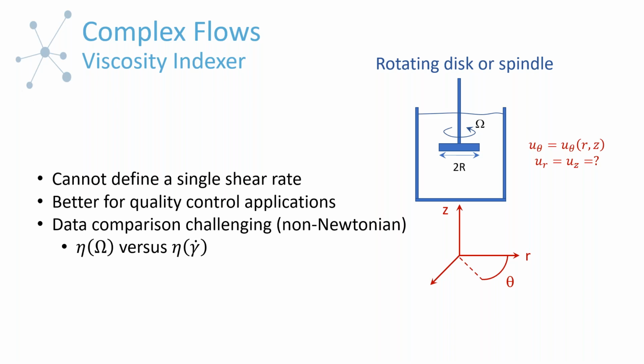So that's really all I'm going to say at the moment about the complex flows. I just wanted to put it out there because it is a measurement, and since we're talking about the flow fields, the kinematics, these are also common, particularly in quality control. I wanted to make the contrast and point out that if you are having challenges making comparisons between this instrument and what I'll call a more research level instrument, then this is likely the problem.